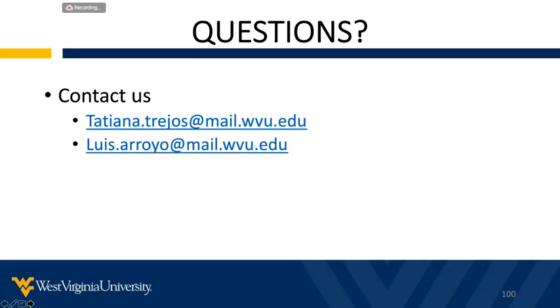All right. Next question that came in asks, what was the difference when collecting GSR from hands at 3 minutes versus 3 hours or possibly longer? So we have 2 populations.